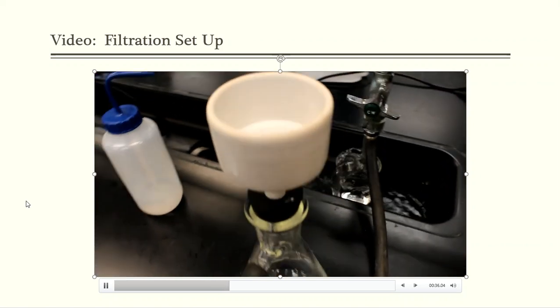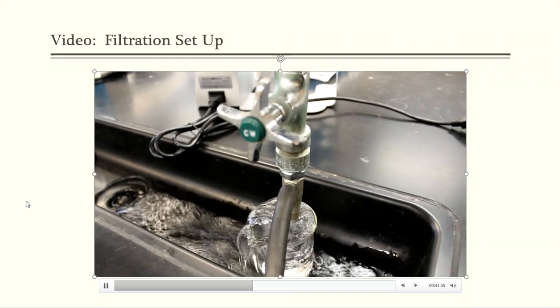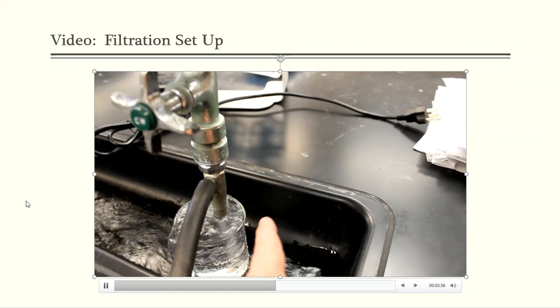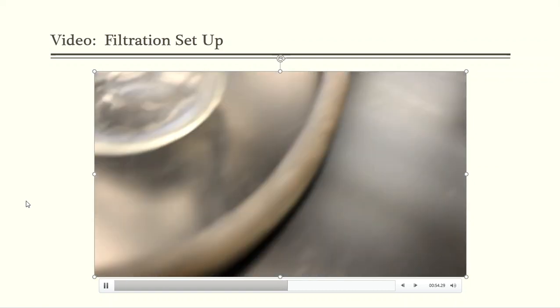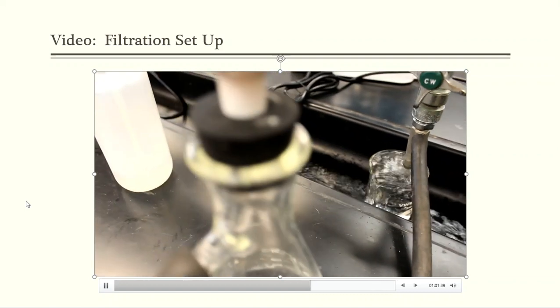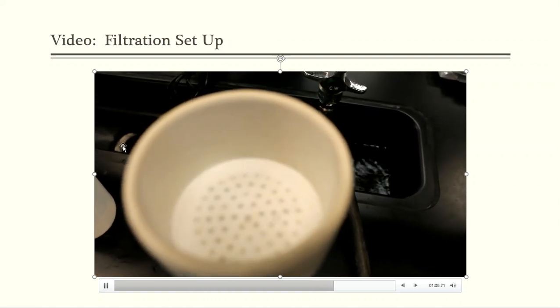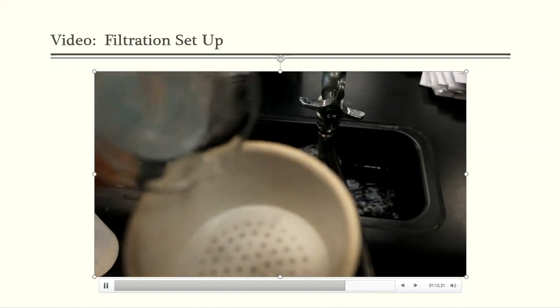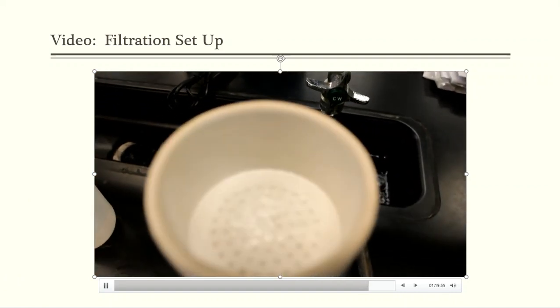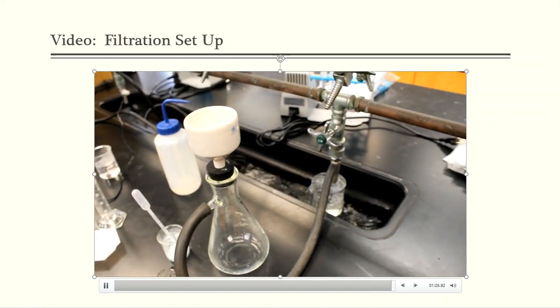So here's a Buchner funnel, and that Buchner funnel is attached to a filter flask, and then that's actually attached to a faucet that has cold water. The purpose of the cold water here is to create a suction. As you can tell, the water is flowing through this way, and this is creating a little bit of air suction through this tube that then goes into the filter flask. That suction is going to be pulling my water through the filter, so I don't have to wait here forever for my stuff to filter and dry. So what I'm going to do in this step is take the slush and pour it through the filter and allow the filter to do its job as far as the solid is concerned. You'll see a few pictures of that process, but here is the actual filter flask aspiration in process.